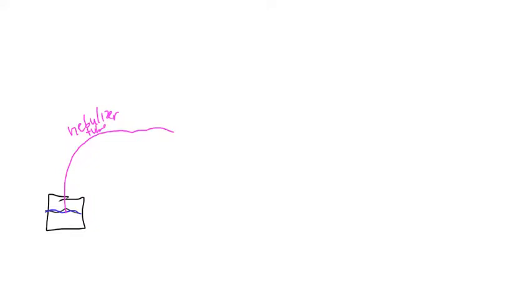This nebulizer tube leads the sample to a piece, and guess what that piece is called? The nebulizer. Who would have ever thought? The nebulizer tube, a piece of plastic that can get clogged, sucks my sample up into the nebulizer, and the nebulizer does a certain job.